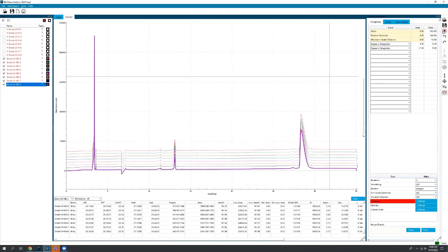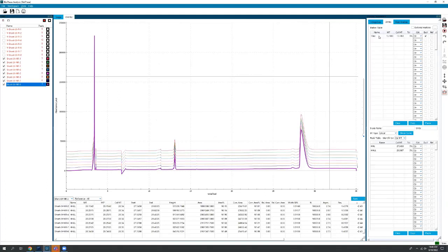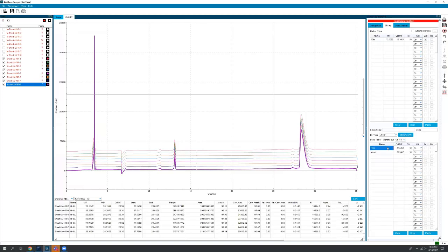I think we've gone over how you can easily analyze that. In this library tab, this is where you can choose your marker, your 10 kilodalton marker. You can exclude it from the peak area, which is nice, so that you're not arbitrarily adding it into your peak area, because that's not part of your sample. Down here, you can add different peak names, change this to intact as you see fit. Do what you want there, analyze that data.